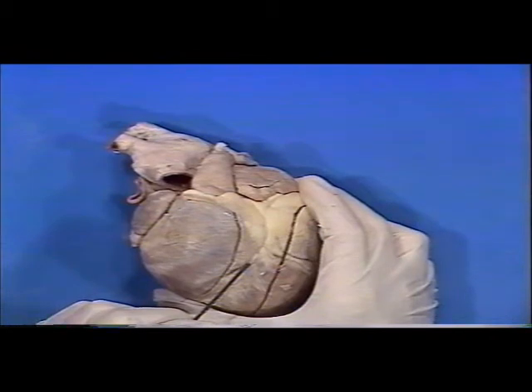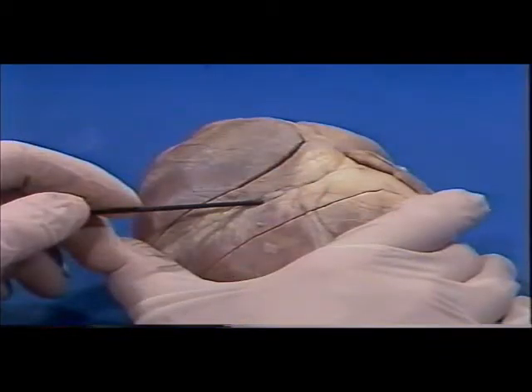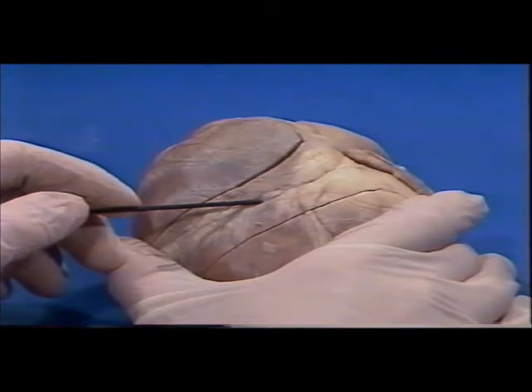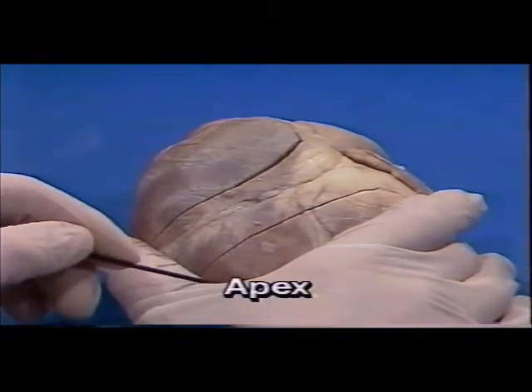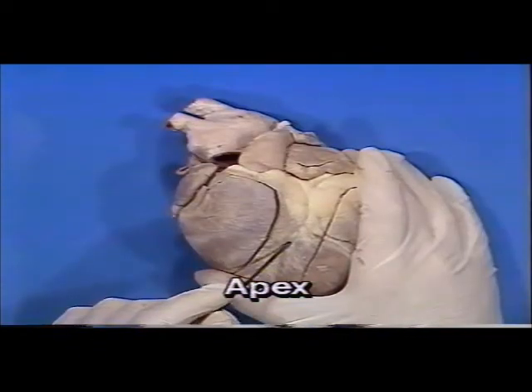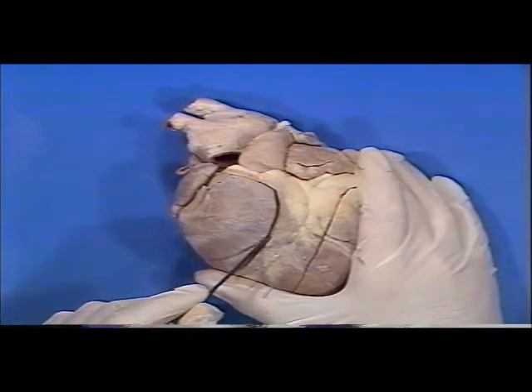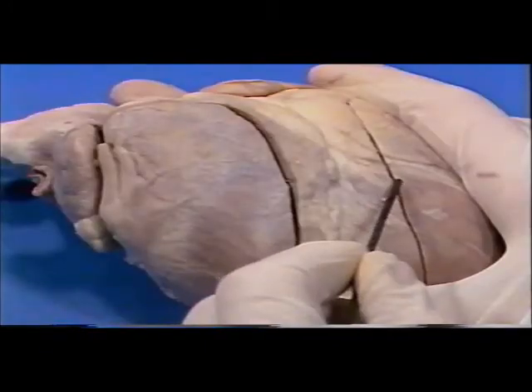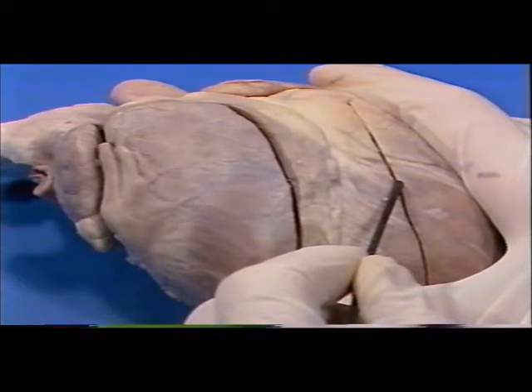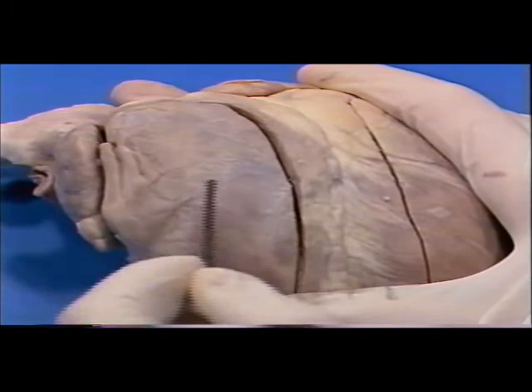There are, of course, further divisions present on the interior of the heart. We will now confirm this by dissecting the internal structures of the heart. Place the heart specimen in front of you with the apex facing you. Take note of the anterior branch of the left coronary artery. Now make a cut on either side of the artery, as I have done here. This will expose the right and the left ventricles.